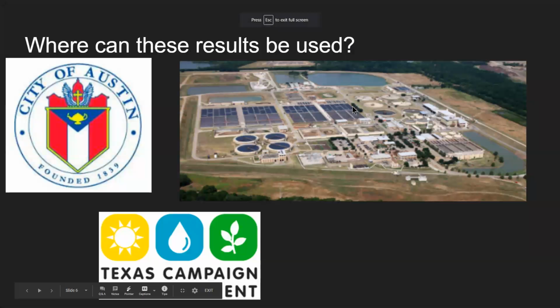So how can these results be used? Detecting metals from the creek water is significant since those concentrations can affect plants and bacteria that are later eaten by other predators. If there is any concerning concentration of heavy metals, it can be sent to environmental organizations, water facility, or even to the local government, which is where experts can find answers to the problem.